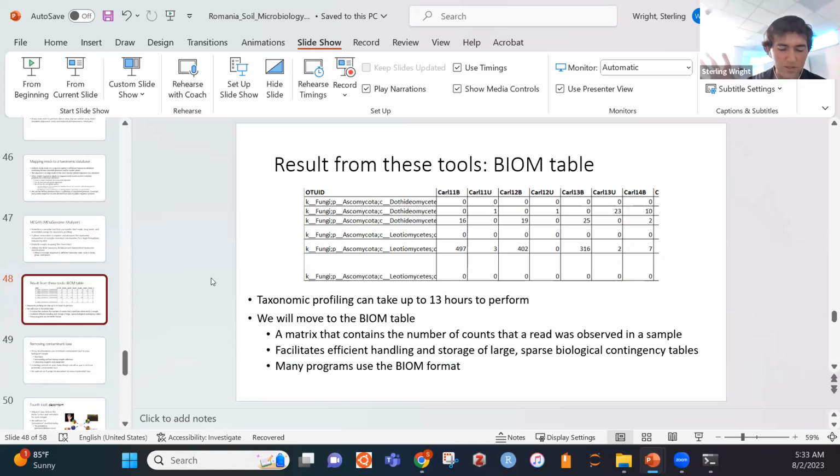When you're loading that into memory, and also loading your 5 to 10 gigabytes of data into memory, it's going to require over a terabyte of memory to run. I wouldn't say it's very common at this point for a lot of institutions or research teams to have that kind of computational resources. People can still use these tools with smaller databases. Some people use a pathogen-only database to map their sequencing reads from their samples.